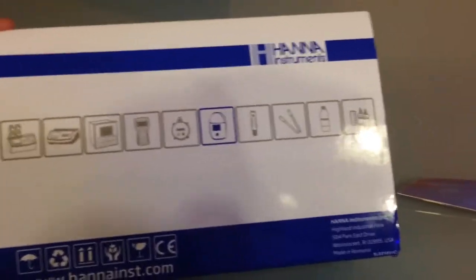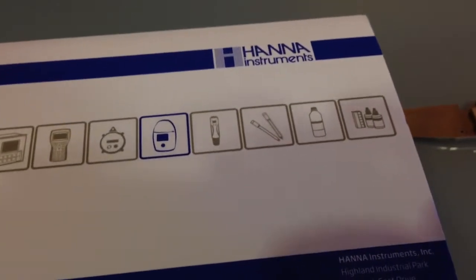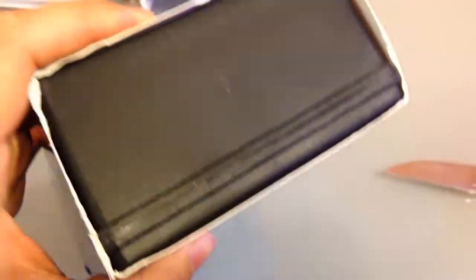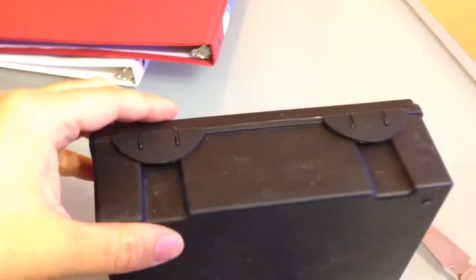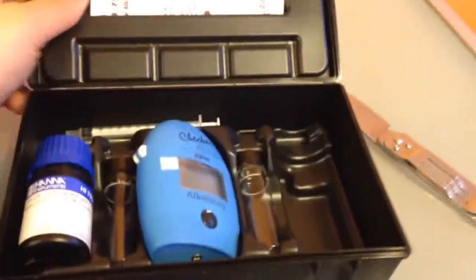Here's what we're looking for. They have the different equipment things, and then this one which is a hand checker. There's a plastic box in here — slide it out with one hand. I like that it comes with the box, because having loose stuff I don't like.